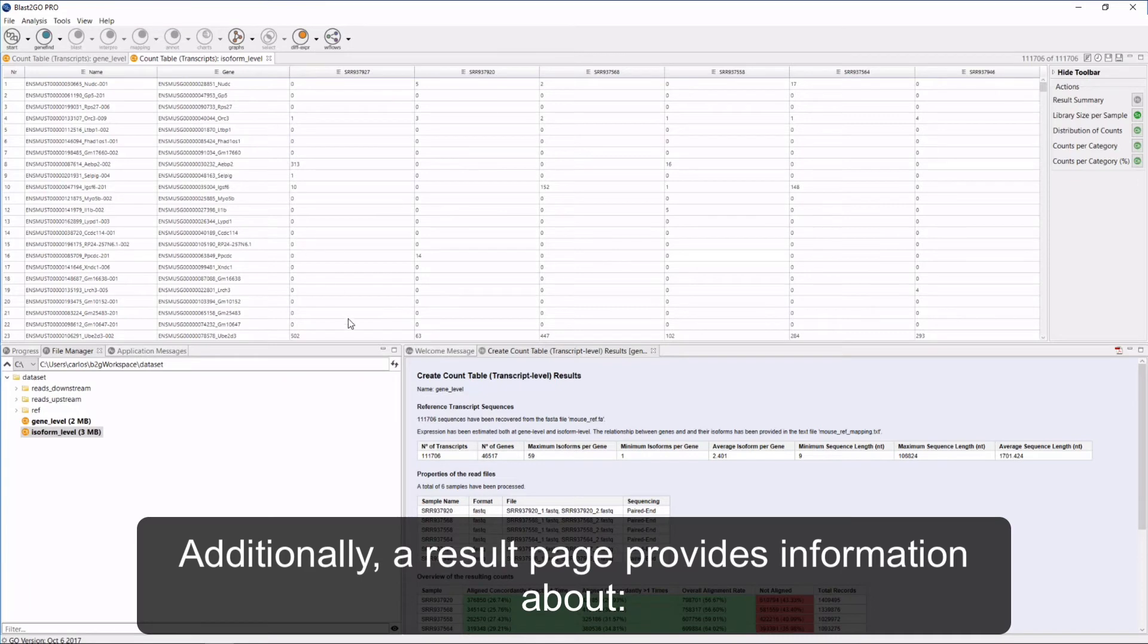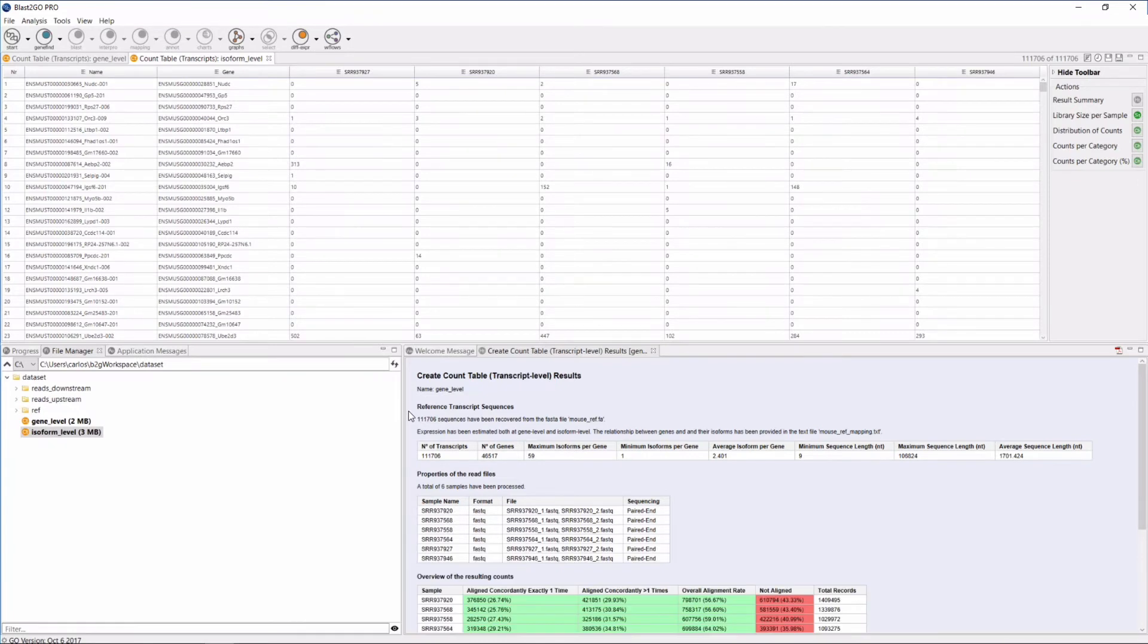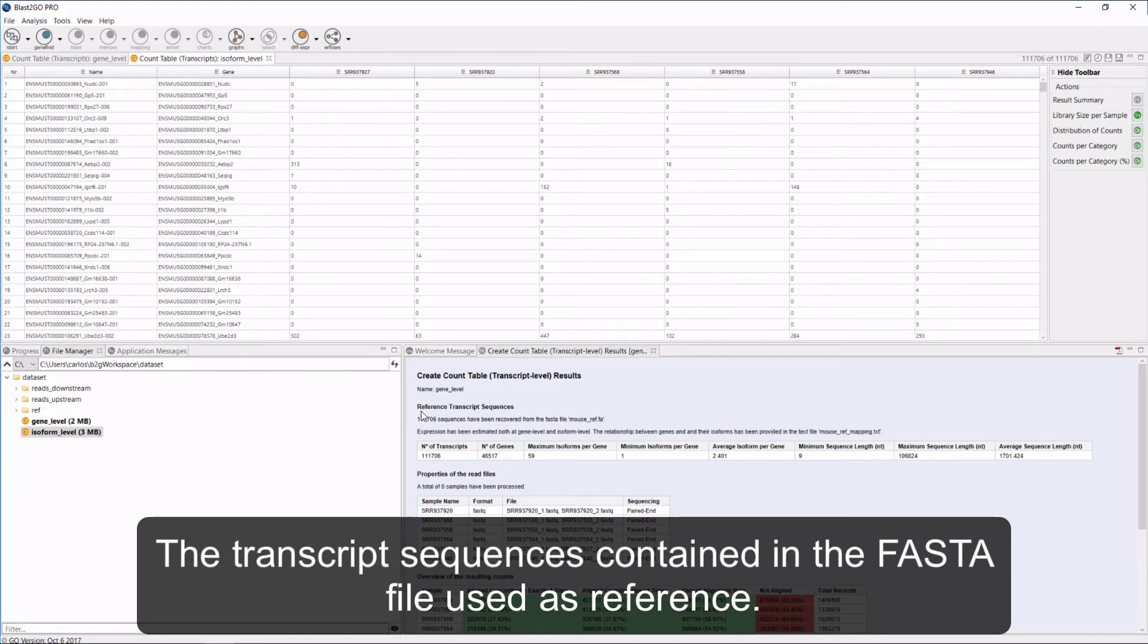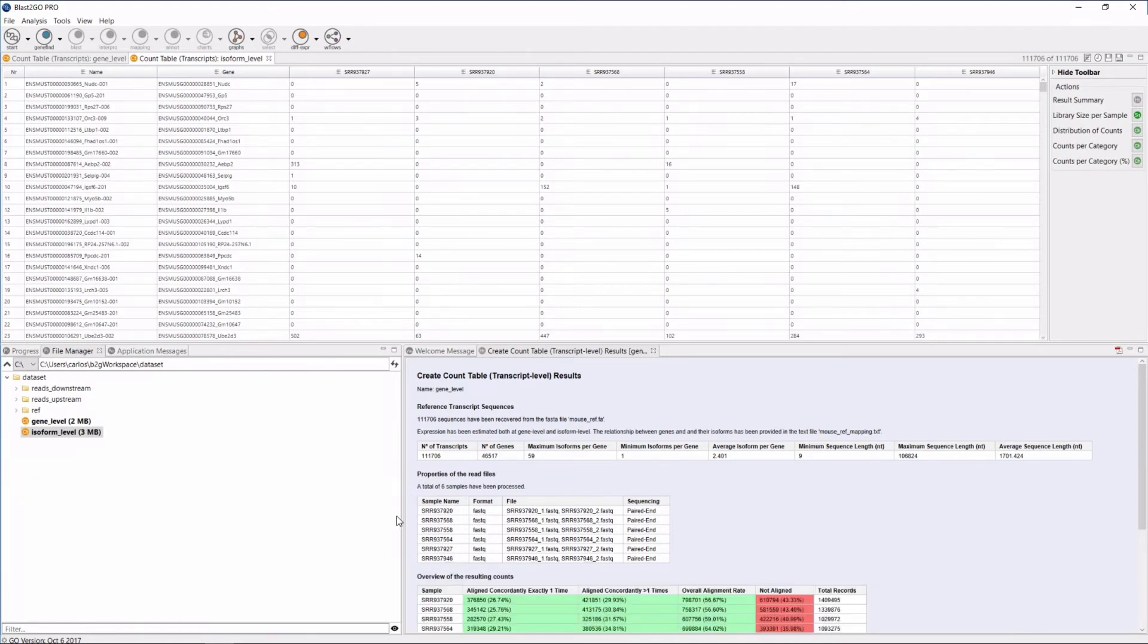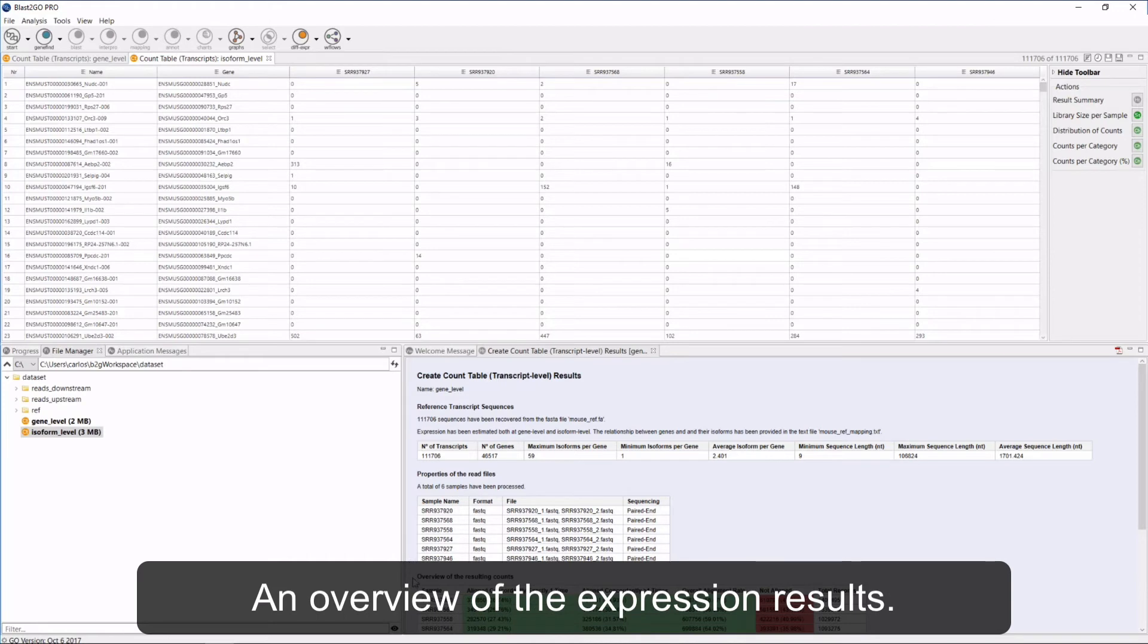Additionally, a result page provides information about the following: the transcript sequences contained in the FASTA file used as reference, the properties of the input read files, and an overview of the expression results.